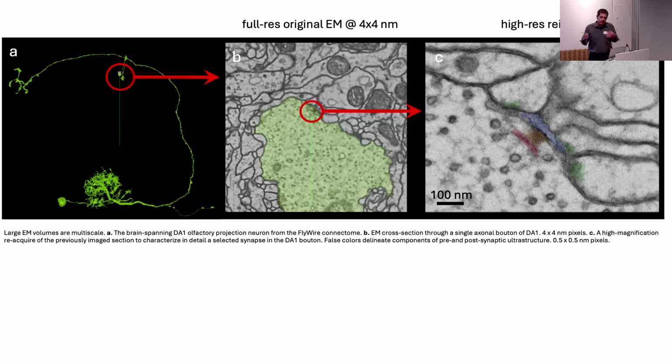Like in FibSEM, you'll get, depending on your acquisition speeds and parameters, maybe 4 nanometers on each edge cubic voxels, or more typically 8 to 10 when you try to encompass large enough volumes to map neuronal circuits. But this just shows an example of, well, on the z-axis of the TEM data, you may be somewhat lower resolution, but for favorable structures in the XY, you're actually at higher.